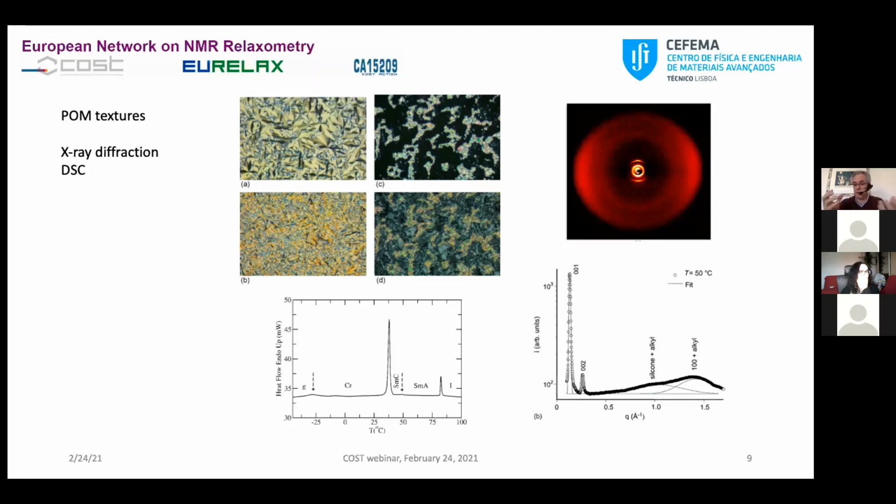If you have an ionic liquid with small anions, eventually in the small angle region you have some additional lines which put into evidence a kind of local layered structure that comes from the separation between the polar and apolar regions. So this information already shows you that there is some order in the system.